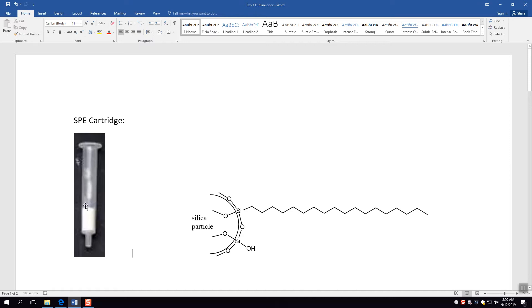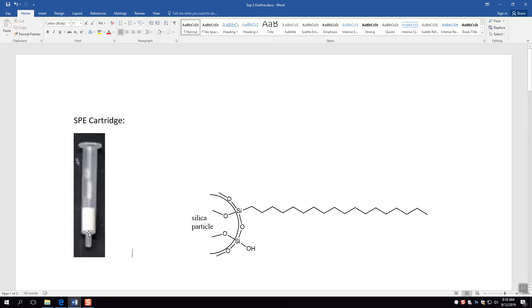You will insert your plunger and push the blue liquid through the silica gel column. Now a couple things could happen. One, you could get a blue liquid coming out the other end — if that happens, then this solid phase is not trapping the blue food coloring. Another thing that could happen is you could get some kind of diffuse blue color throughout the entire solid phase, meaning you're not trapping it well because it's moving through a lot of the column. Or in the ideal case, you get a nice dark blue layer right at the top of this silica gel column, telling you that this solid phase is extracting this molecule very well — we're trapping it.